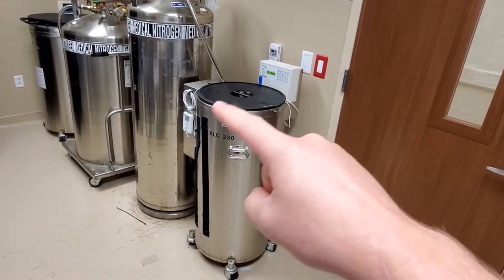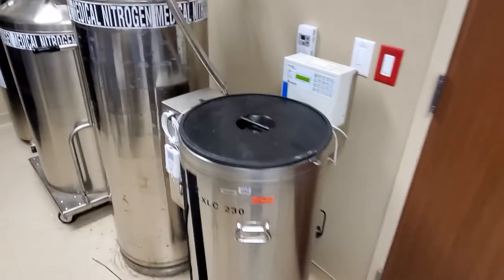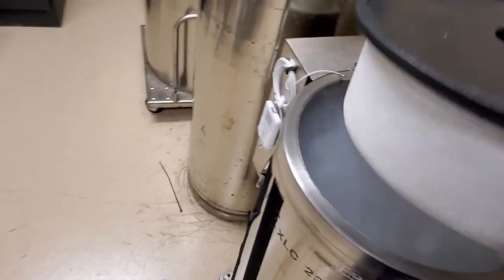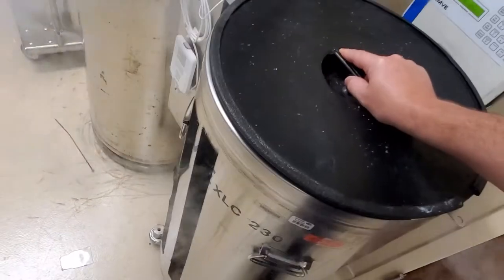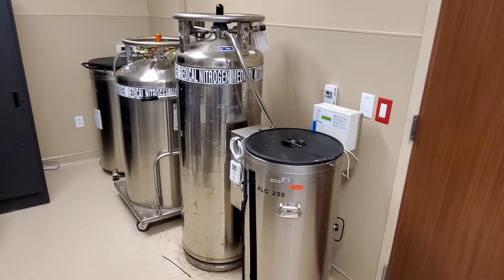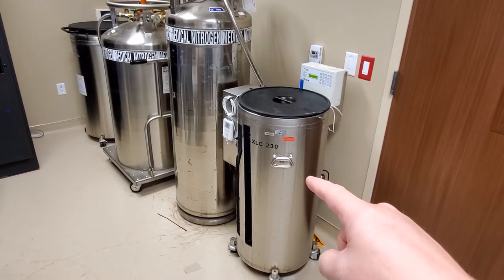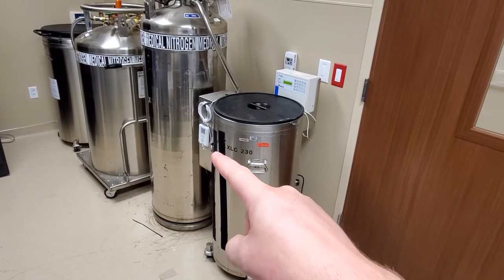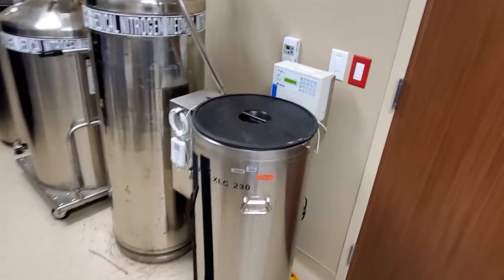The controllers only adjust the level of Liquid Nitrogen in the freezer. As we come over, I can lift it up and you can see there's a bunch of smoke that comes out — that is the boil off of the Liquid Nitrogen. Unlike regular freezers, these units rely on an endothermic reaction from the boil off of the Nitrogen, which absorbs a massive amount of heat. That is why they are ultra low freezers.